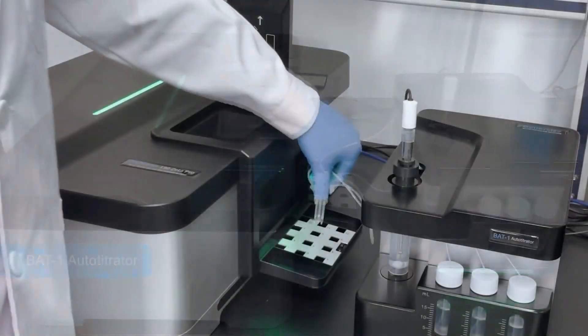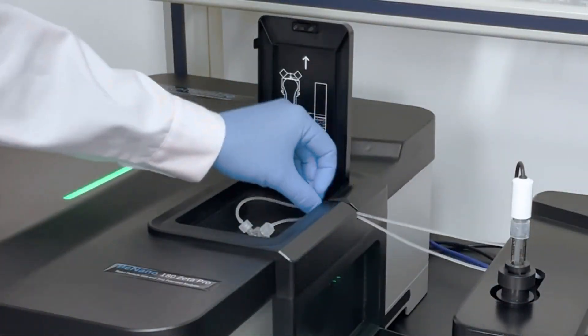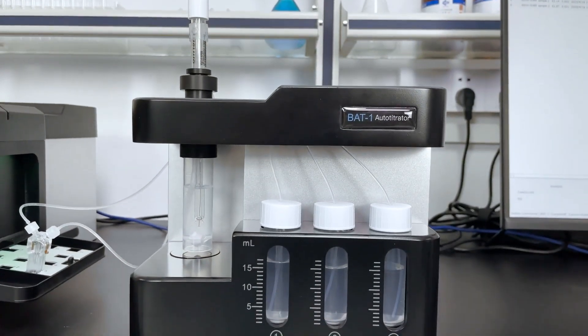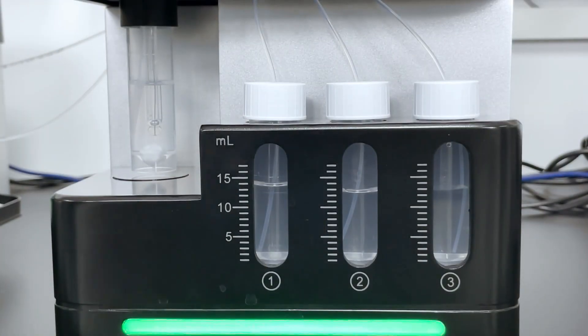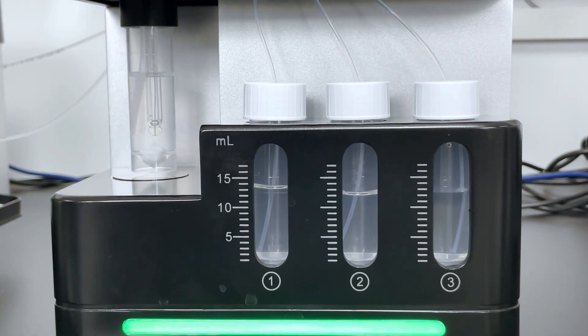For those who want to measure the zeta potential of materials, which depends strongly on environment pH, the B801 auto titrator accessory is an ideal option. It has three high-precision titration pumps which intelligently adjust the titrant selection for optimal efficiency and accuracy.